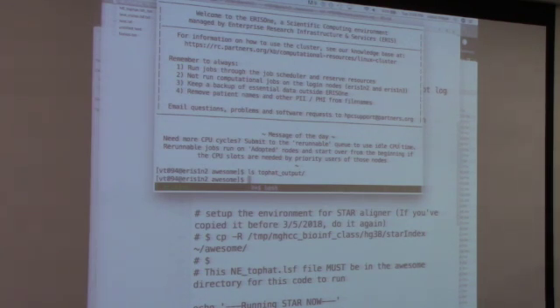I guess I'll just use the regular fast. Yours going. And then you can rerun. Oh, this is very similar to last week, but you're building on it, because last week was about fast. Did it actually do QC? No, maybe it logged this.